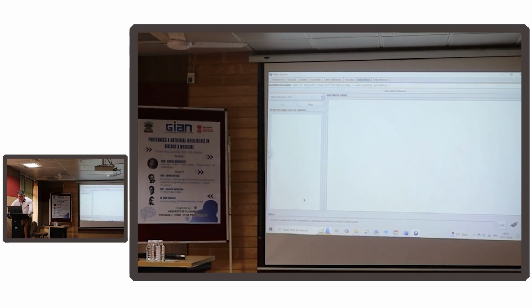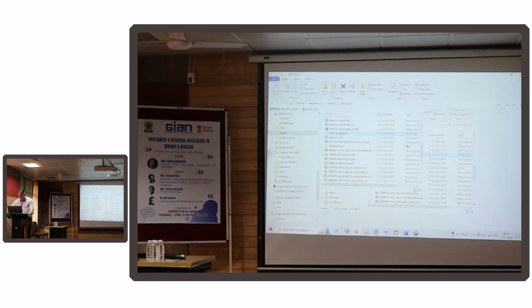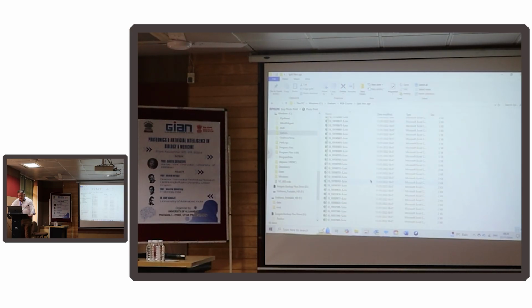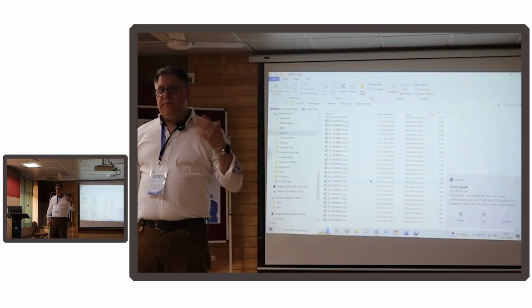Right, while we're doing that, I just want to show you another way of doing this. In this folder are files which are part of a bigger file.